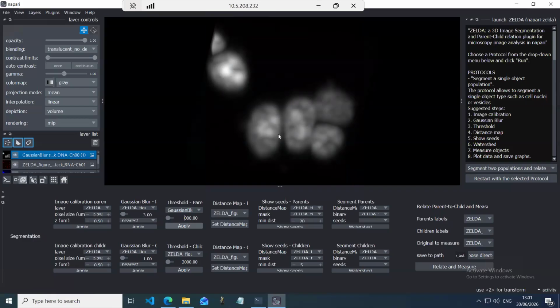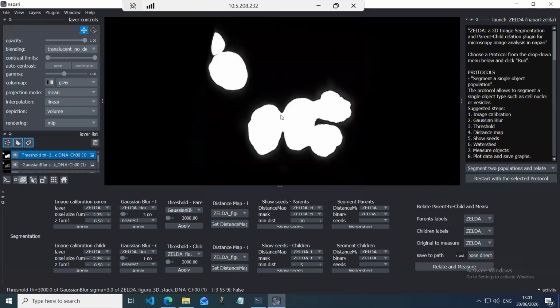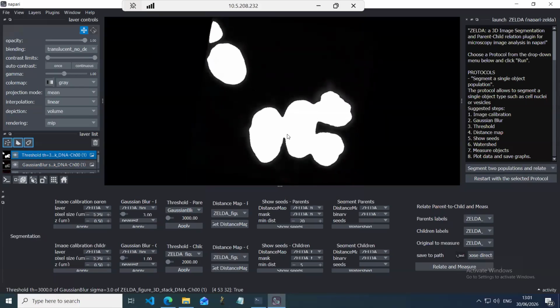So imagine now I go up with 3000. You will see that the binary picture that is created now contains fewer pixels. So this would be a way in order to get cells that are sort of isolated between themselves. It will help in order to separate them and have proper labels. If I'm happy with this solution, I can proceed with a further step.